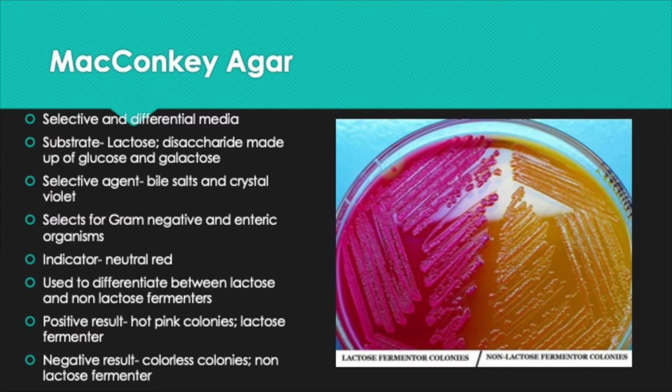And then next week we're going to go over another test that has another kind of pH indicator in it. So you're going to see that there are lots of colors, lots of indicators that all change colors. Some of them the same color, some of them different colors. So these charts are really going to help you whenever you're memorizing and trying to remember all of this stuff, because it's a lot of stuff to memorize.